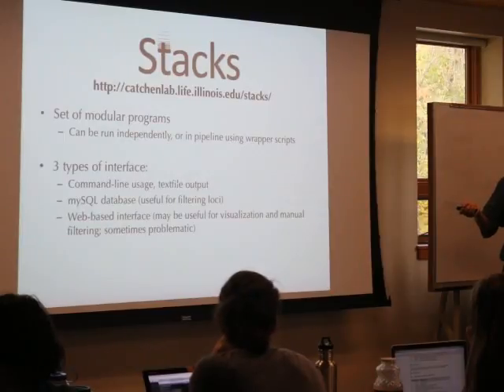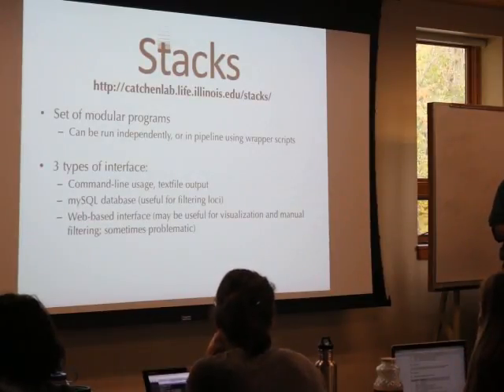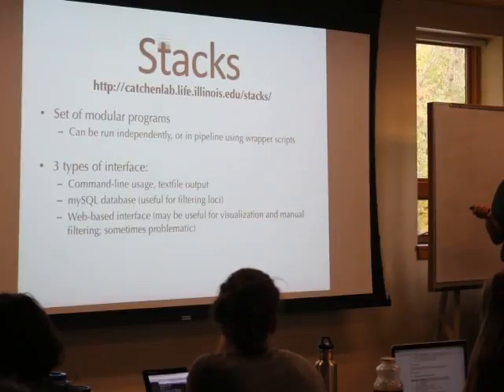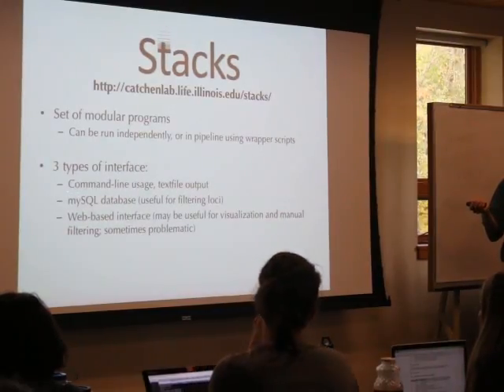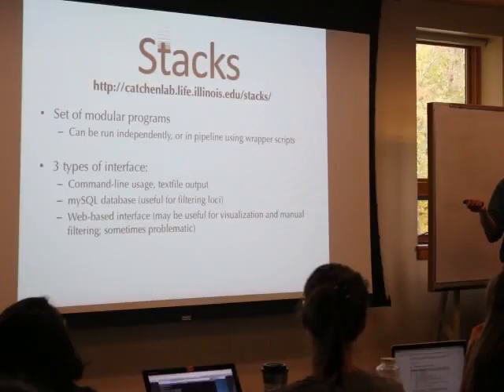I bring up Unix because Stacks has three different types of user interface. The first is command line with text files for inputs and outputs. So this is all based on Unix. This is essentially what I use almost exclusively, and I think it's probably what most people use who are doing really hardcore Stacks analysis. They're just doing everything on the command line, text files and stuff like that.